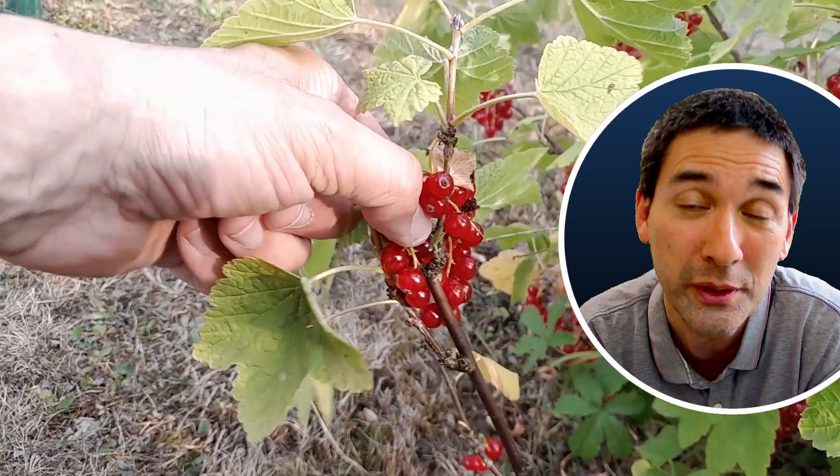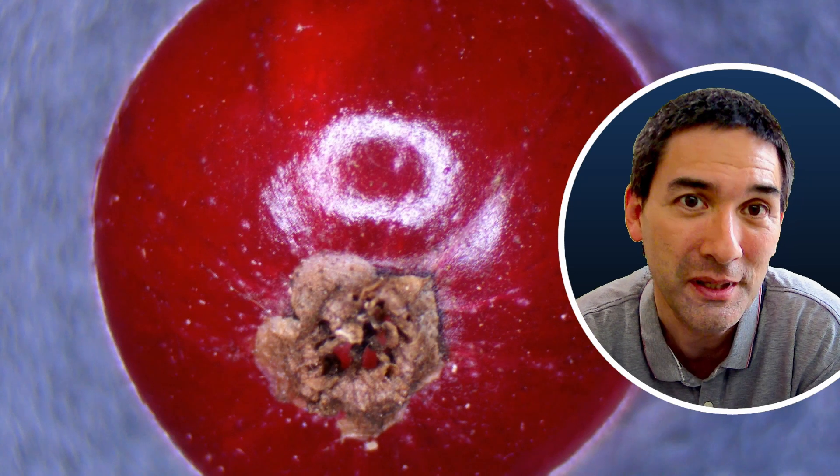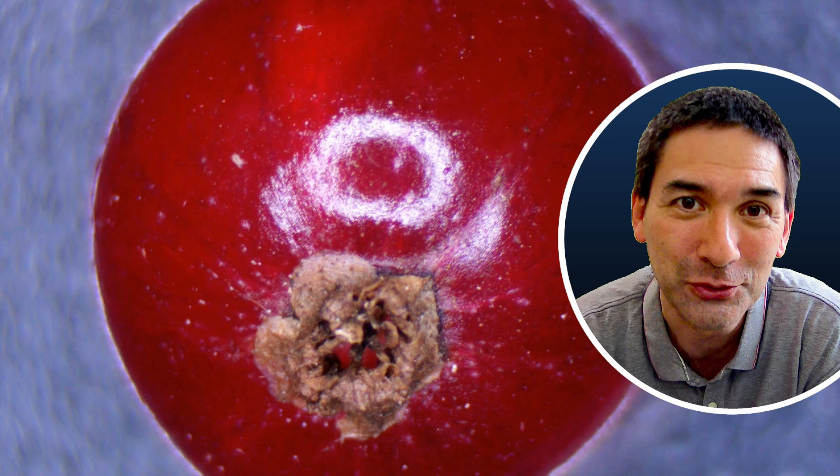I like their taste a lot. They're very high in nutrients — vitamin C as well — but I'm not the only one who likes those berries, because under my stereo microscope I could see tiny little mites running around on those berries.